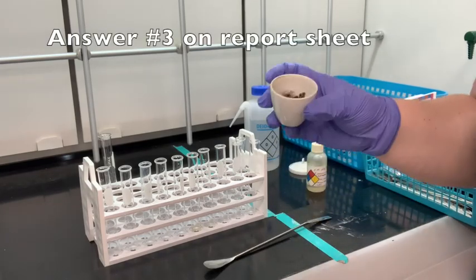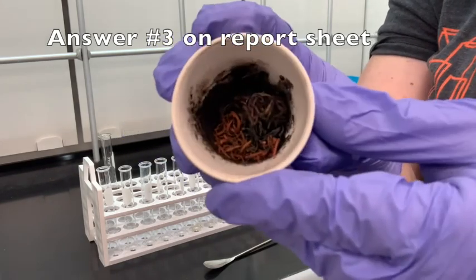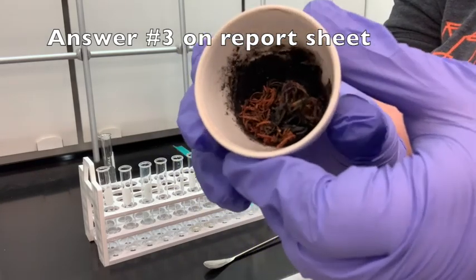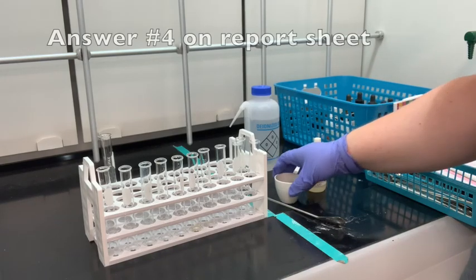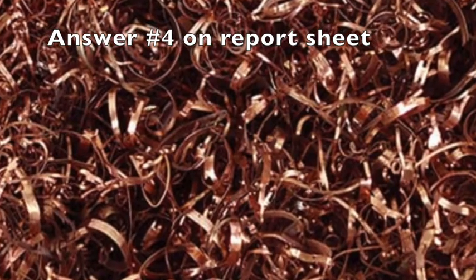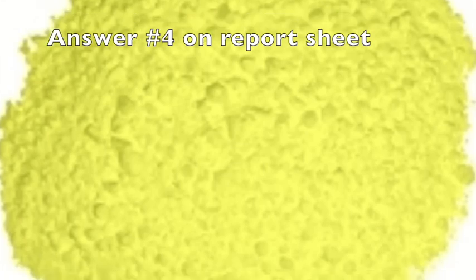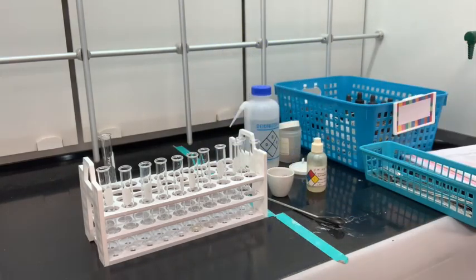The next question that you're going to fill out on your report sheet is, what color is it? There's some black in there. There's some kind of brownish stuff in there, and you can clearly tell, if you think about what copper looks like, it's shiny. So you want to think about whether a reaction has happened between copper and sulfur to give us this stuff. That answers questions 1 through 4.